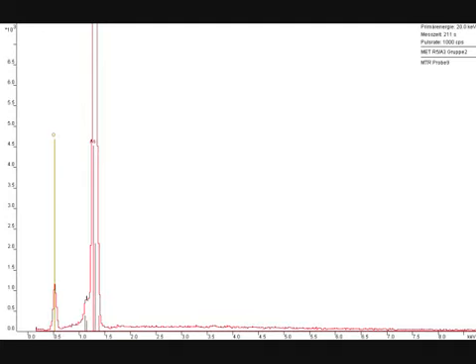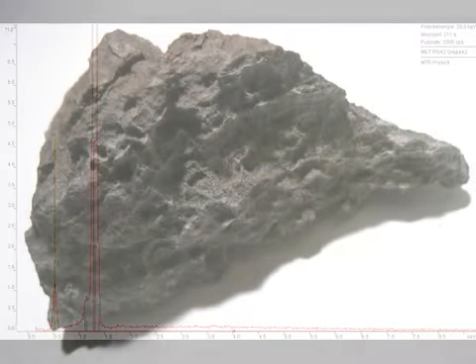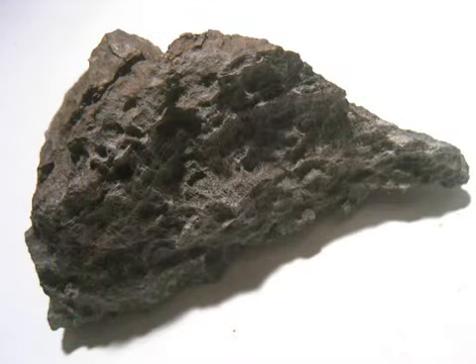You know that gray layer on lead, for example. If you scrape that off, you have a shiny silvery metal, and it's the same with arsenic. So we just get those nice peaks from arsenic and oxygen. Very clear and easy to see. That is what the actual mineral looks like. Arsenic with that grayish layer of oxygen.